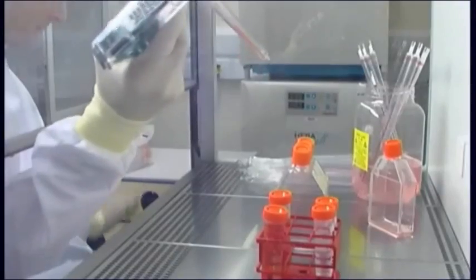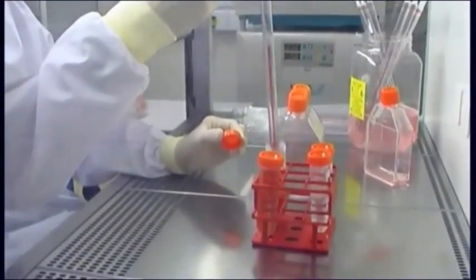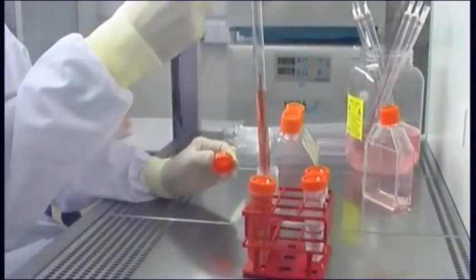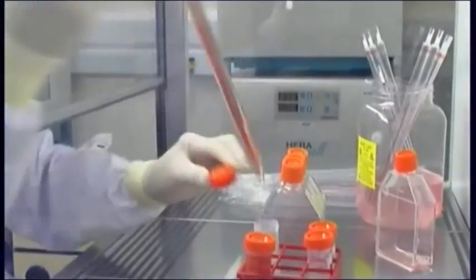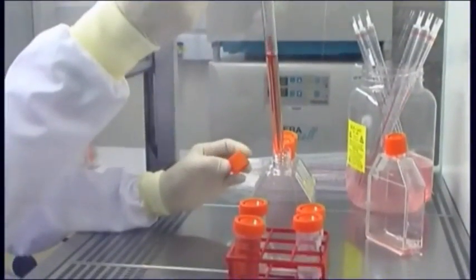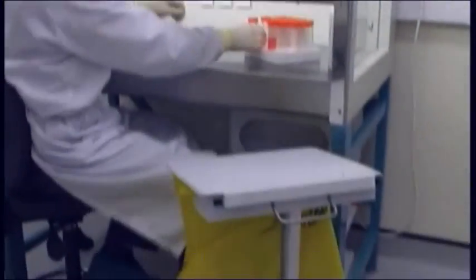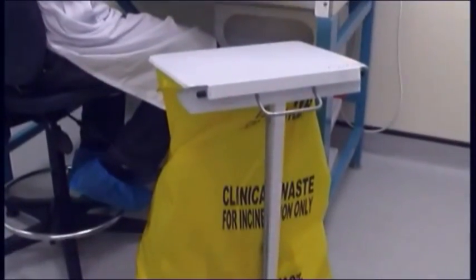Waste disposal. Tissue culture generates large amounts of waste material, such as culture flasks containing cells and media, used pipettes and other liquid waste. These should be considered as a biohazard and placed in labeled waste bags prior to destruction by autoclaving or incineration.